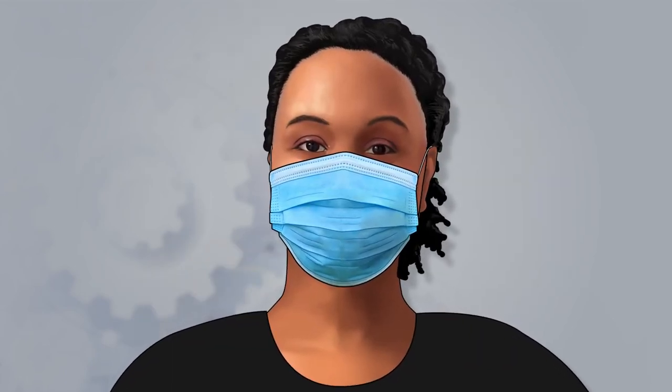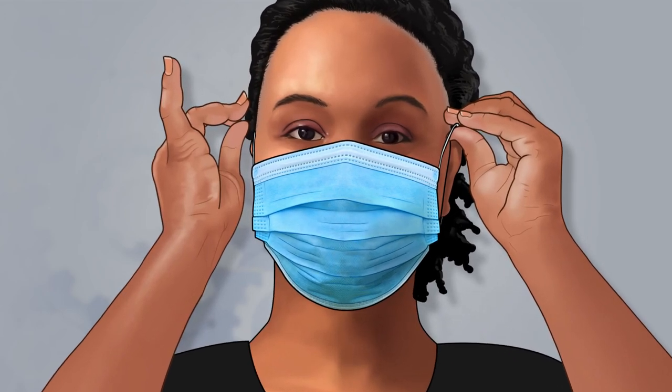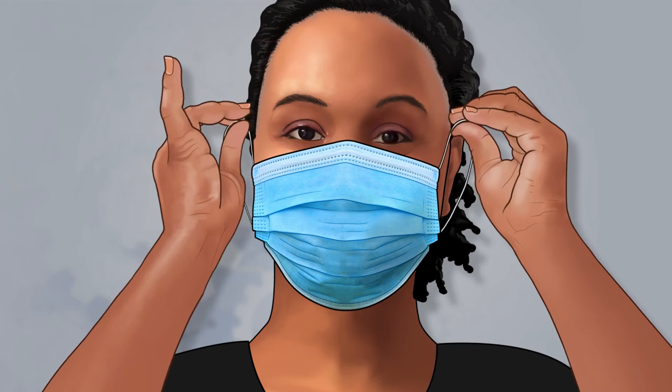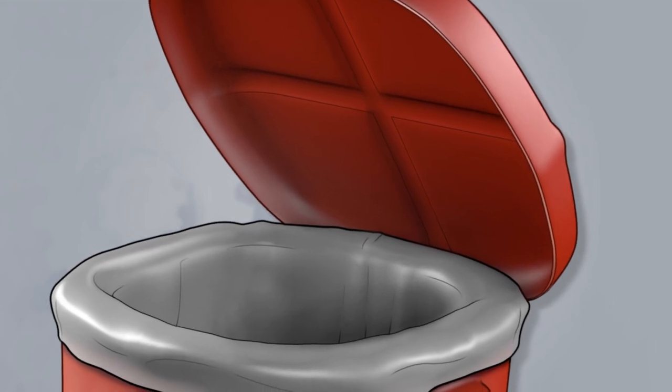To remove your disposable face mask, remove the ear loops, taking care to avoid touching the potentially contaminated exterior surface of the face mask. Pull the mask away from your face and dispose of it in the biohazard waste container.